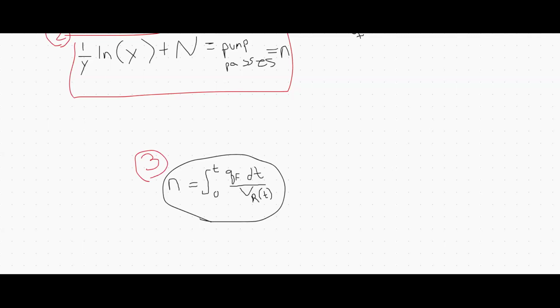Pretty much what I have done is, I have an Excel file for my run, which I'll show you in a second, but it just describes how the permeate mass, so call this M permeate, or like the volume of the permeate over time, changes, okay?